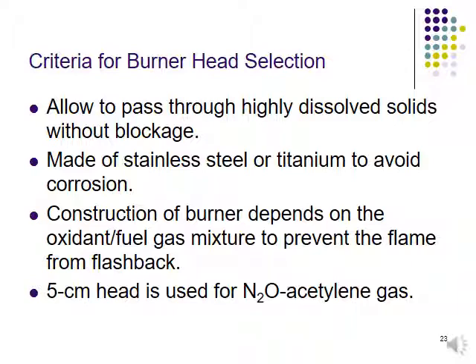And then you also need to consider the 5 centimeter head of measurement for nitrous oxide acetylene gas as a flame.